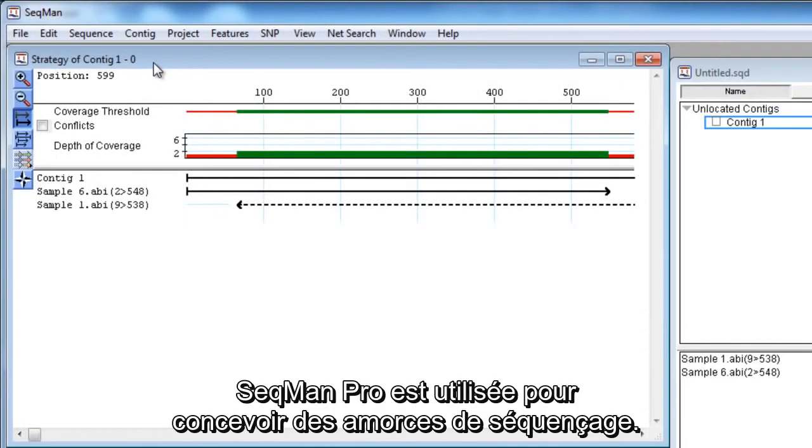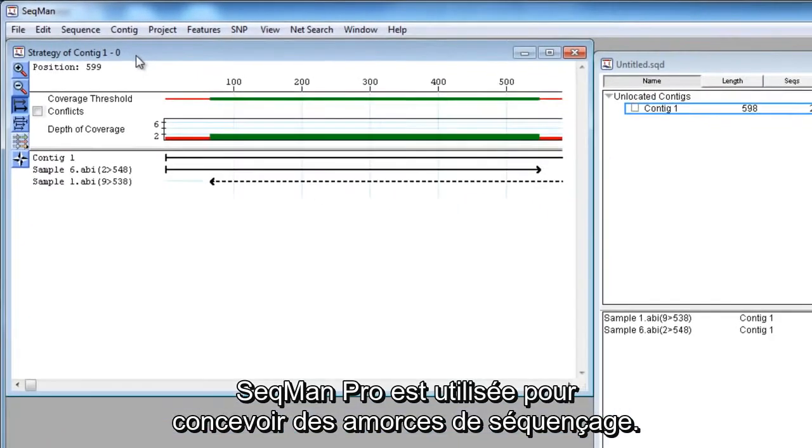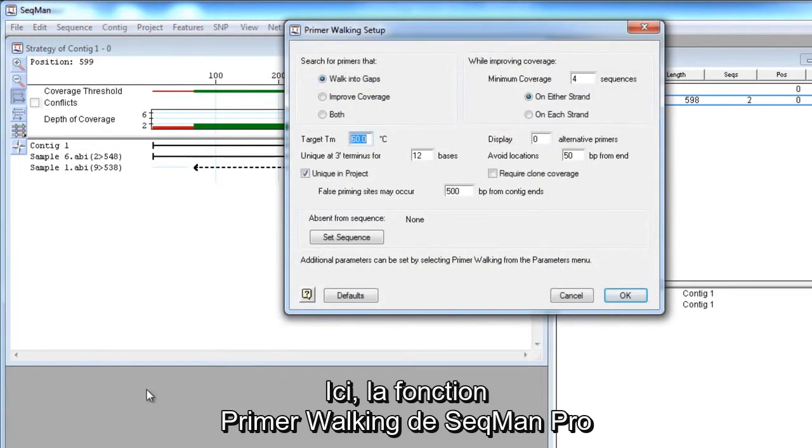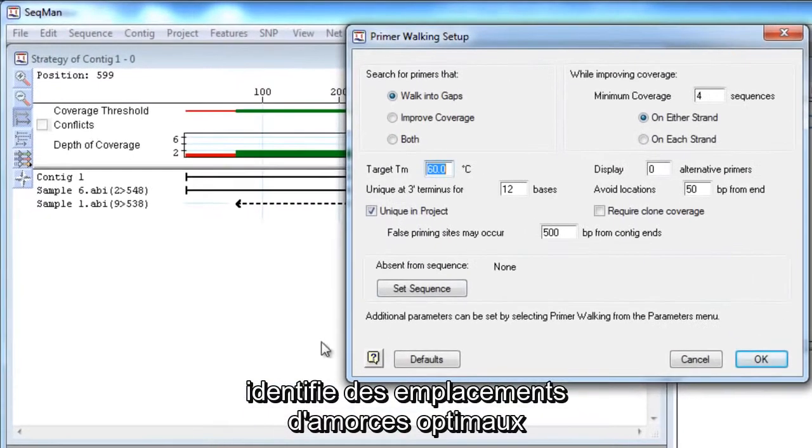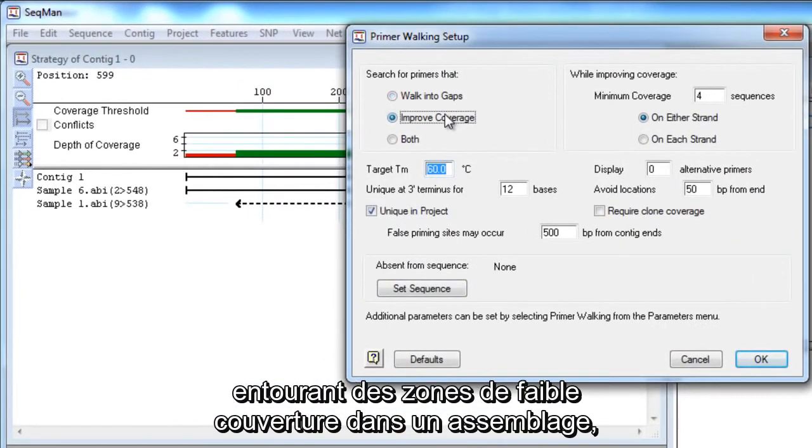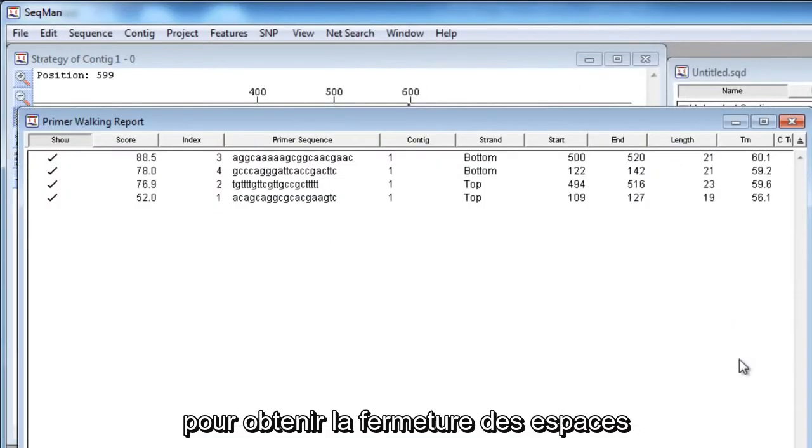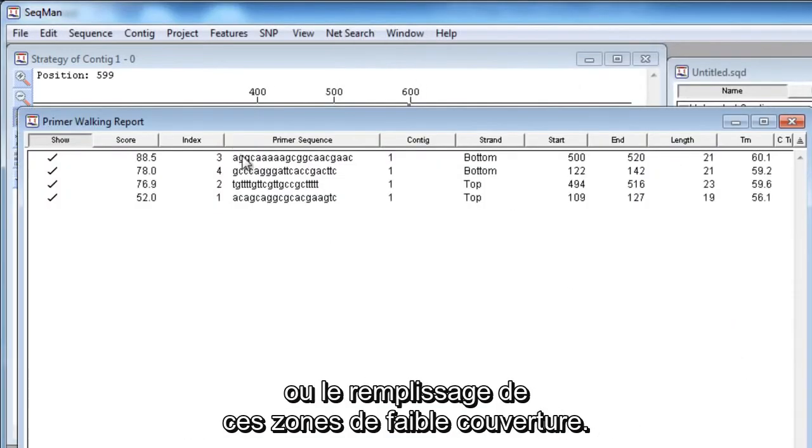SeqMan Pro can be used to design sequencing primers. Here, SeqMan Pro's Primer Walking feature identifies optimal primer locations surrounding areas of low coverage in an assembly, to drive the closure of gaps or to fill in these low coverage areas.